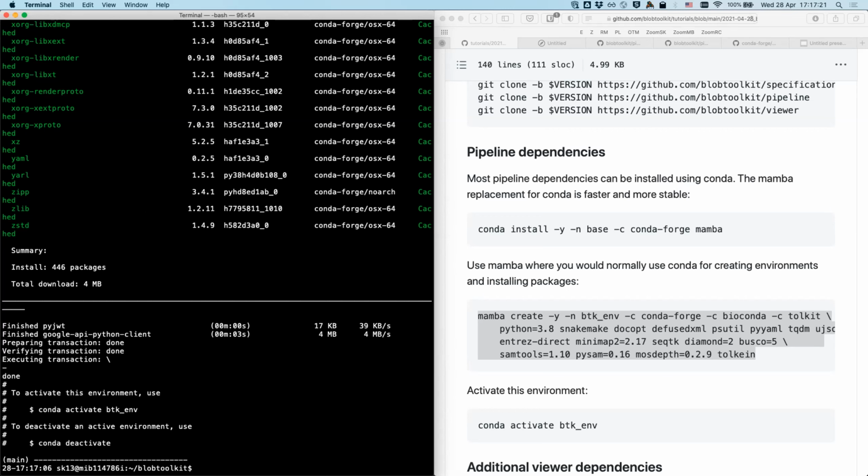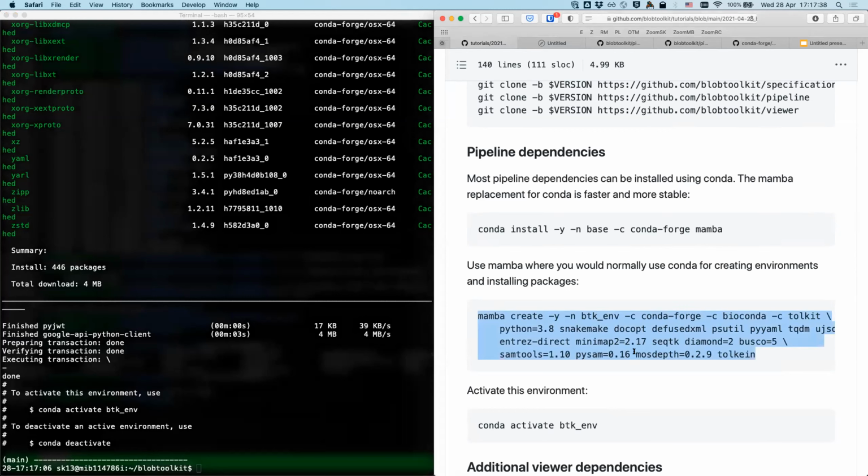I was able to create the blob there. Then you're fine, if you already have a blob there. Yes, I only found a problem with this step about the SAMtools and minimap. So it's possible that because in the previous version, I hadn't specified the depth, and that worked. So it might actually be good for you to run this command if you can.